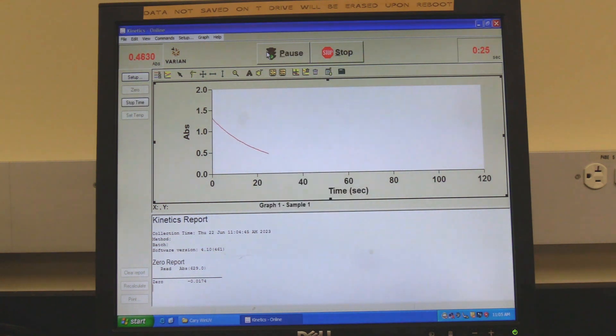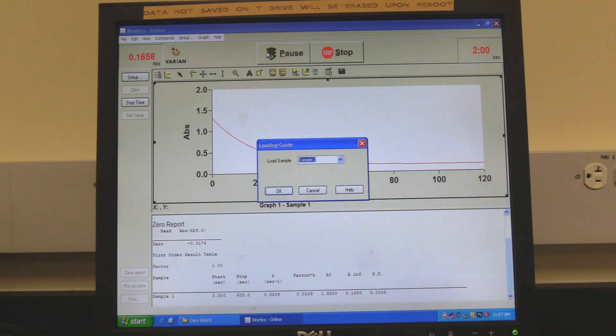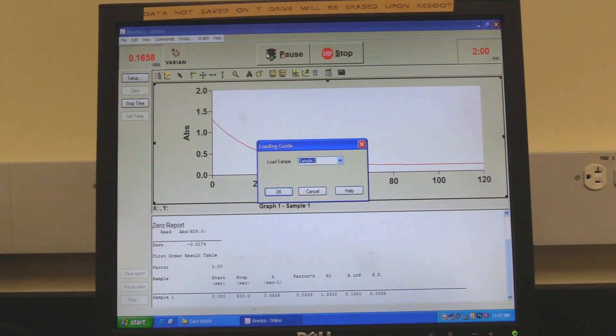Wait for the measurement to finish. The spectrum will appear. The software will prompt for the next sample name. If measuring another sample, click on OK. The report area will have the calculated data.